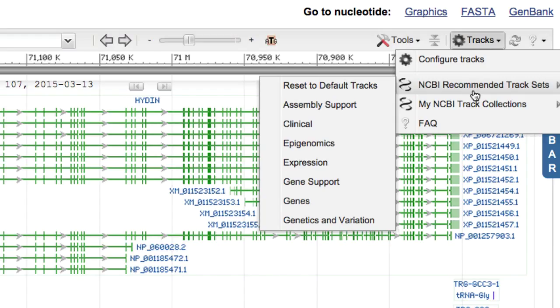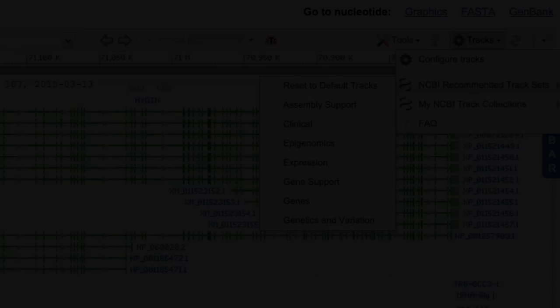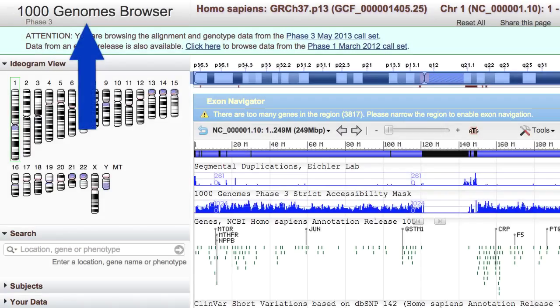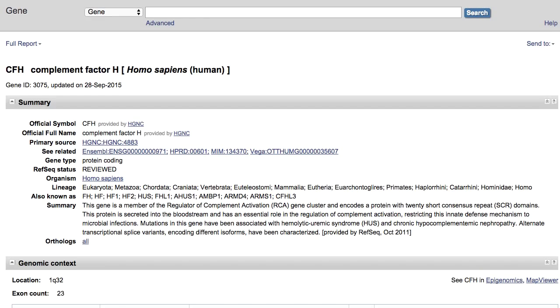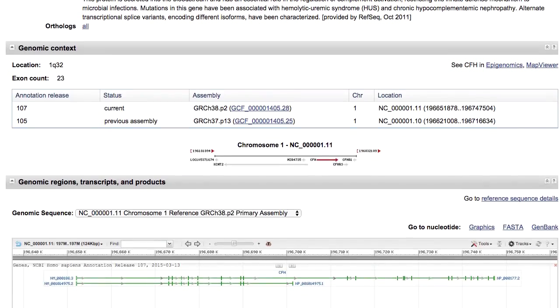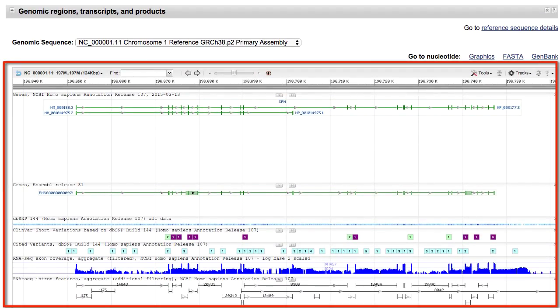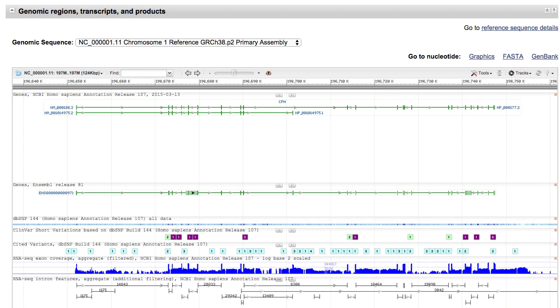This demonstration is intended for those of you at least somewhat familiar with the NCBI genome browsers, such as Variation Viewer, or the Thousand Genomes browser, or the NCBI Sequence Viewer graphical displays, such as those embedded on gene, dbSNP, or CloneDB record pages. We provide active links near the end of this video to those browser tutorials.